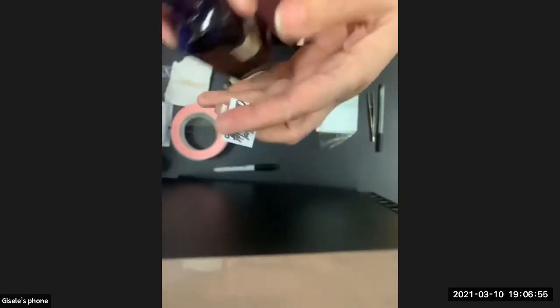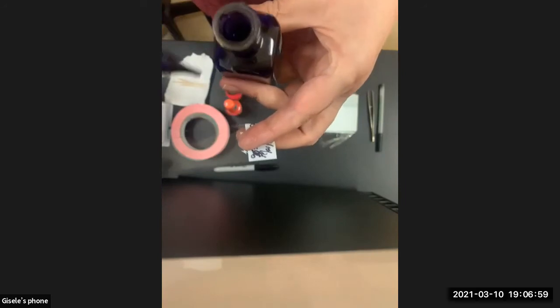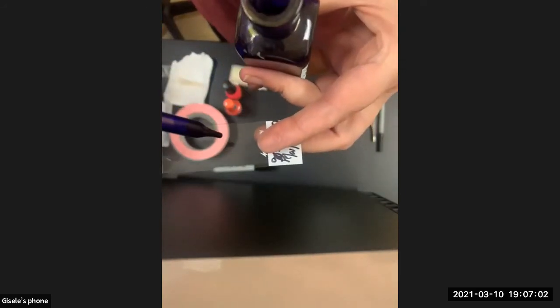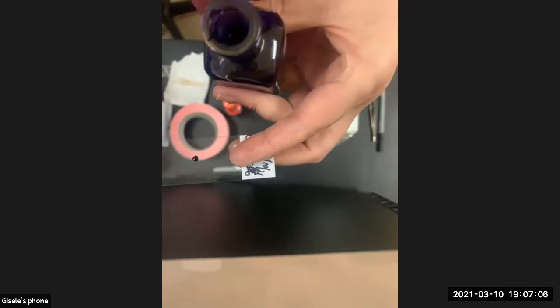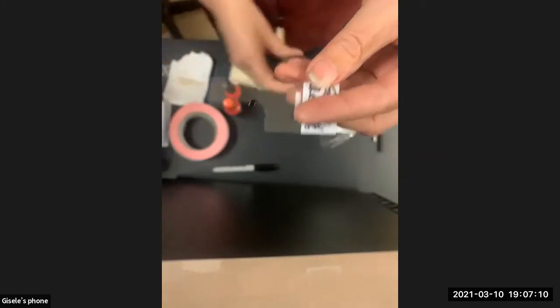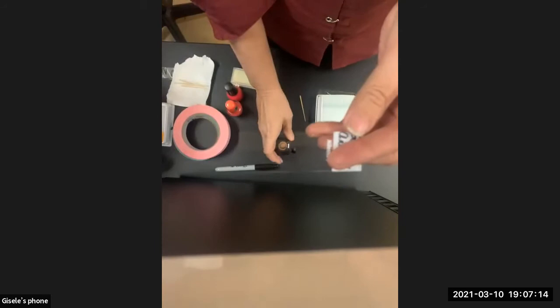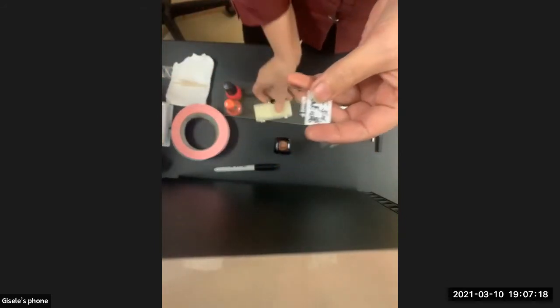Now, what I want to point out about methylene blue is it's very powerful. You just need a teensy bit. Like, wow, I actually put too little on. I managed to do that. You just need a little bit of it, plus your cheek cells, and that is more than enough to stain your cheek cells. So next thing you're going to do is put a cover slip.